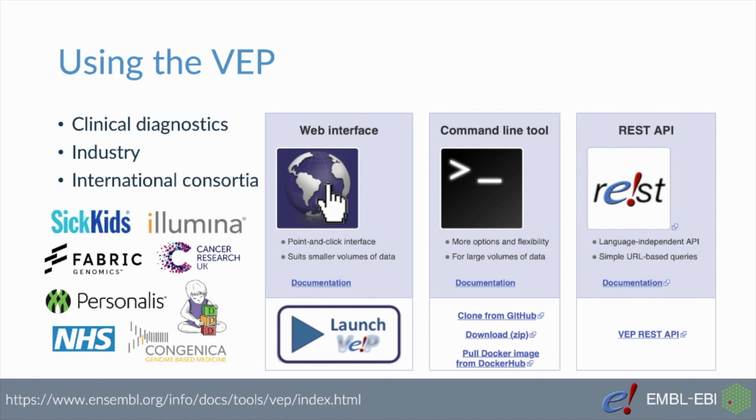There are different ways of using VEP. You can use our online version of VEP, which we're going to do in a minute in our demonstration. You can also use the script version. It doesn't require much scripting. You just have to run it. And finally, you can also use VEP using our API. VEP is widely used in both a clinical environment and in the industry. It's also used by many international consortia.